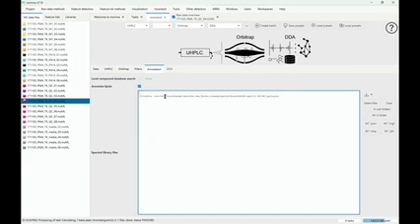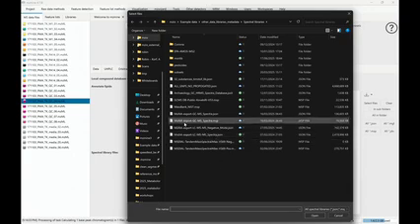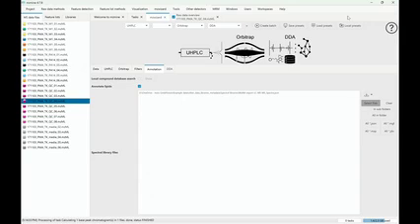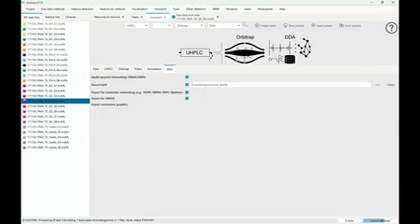Then I can drag and drop this in here, or of course I can go on select files. And this is already going to filter out the spectral library formats. JSON is just a very general purpose format. You're also going to find JSON files for everything else, whereas CSV or TSV is very standardized, just an open format. But with the JSON, this is the format of MoNA. We can select it, and we also check annotate lipids, just in case we have some lipids, we can see them.